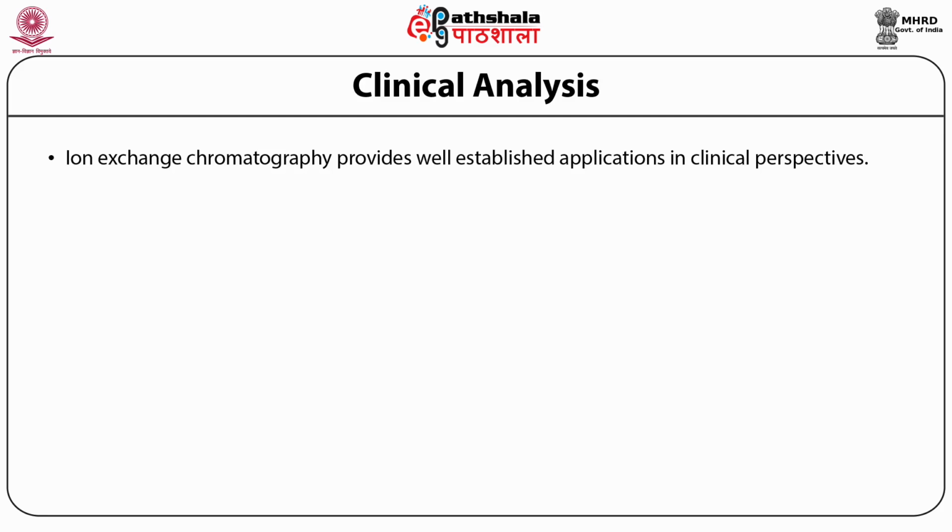It can be utilized to evaluate various ions and substances in the pharmaceutical and clinical aspects. It contributes the availability of a great extent of stationary phases and precise detectors.